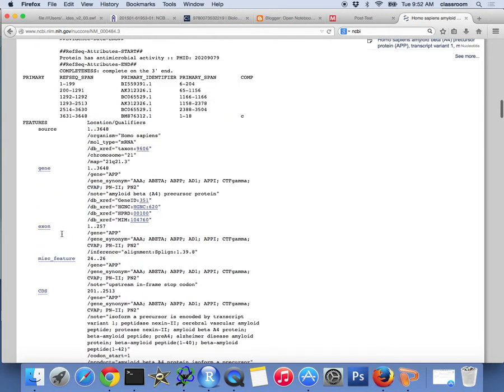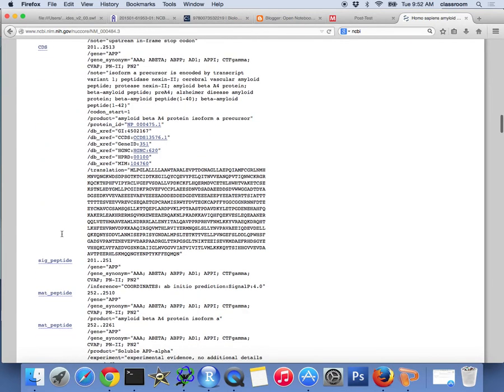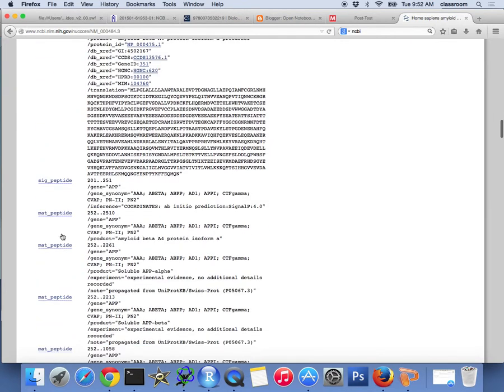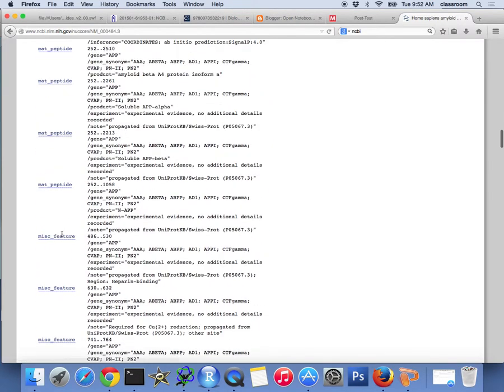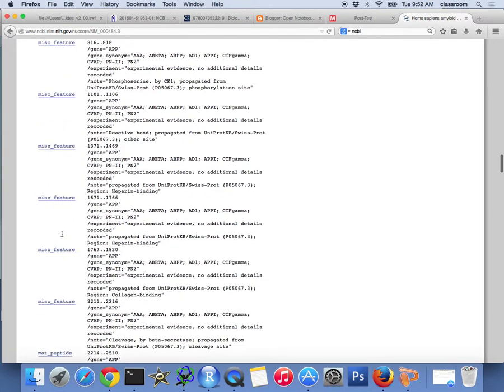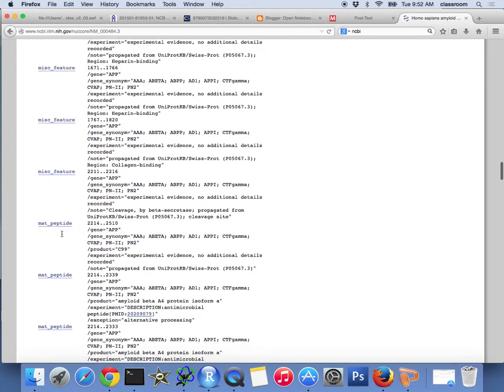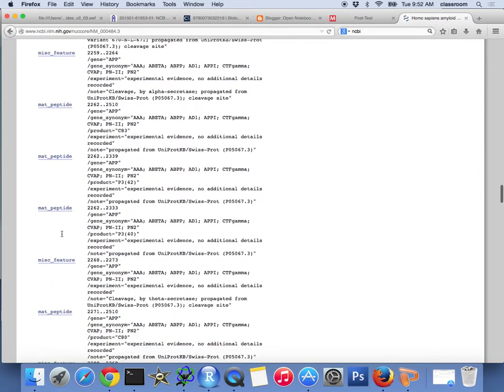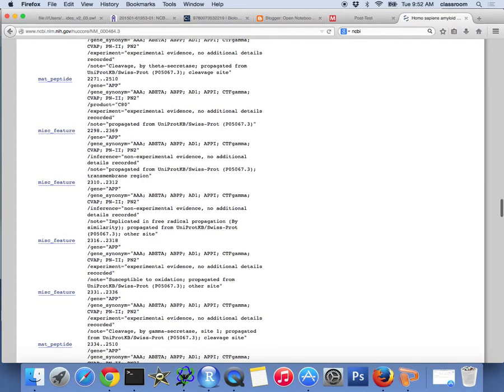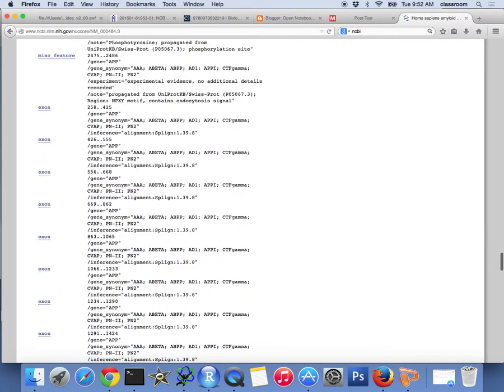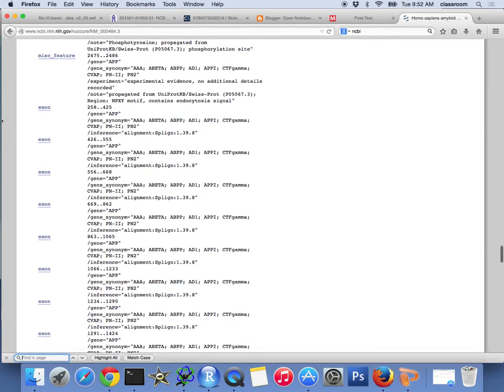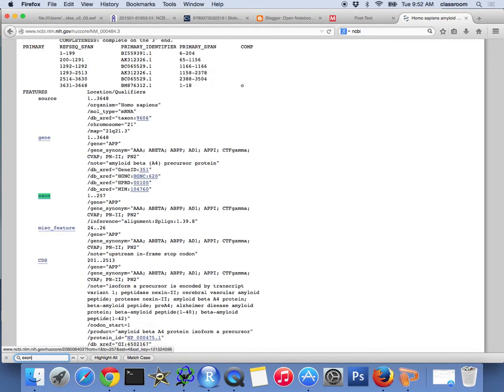So let's look for the exon again. This really has a lot of features, but you just have to be patient. Look for the exon. Well, on the website, you can actually, there is one thing. If you don't want to scroll, you can actually search. So if you go to edit, there is a search. So search for exon. That's the first exon. I search again.